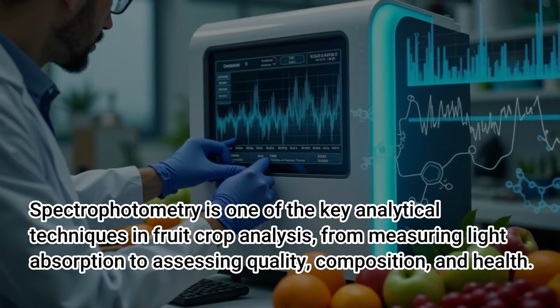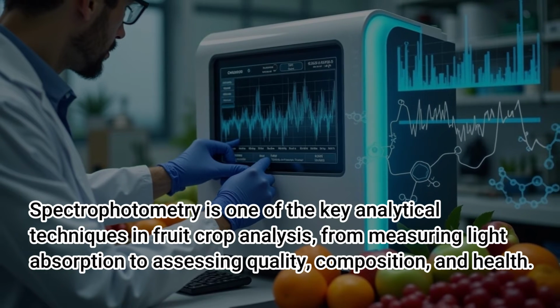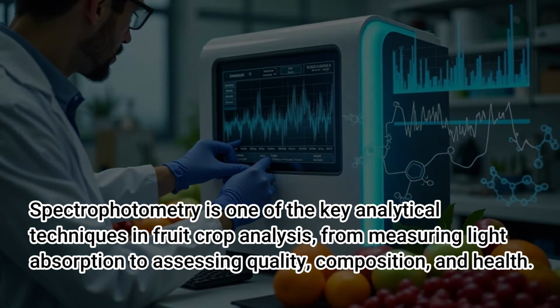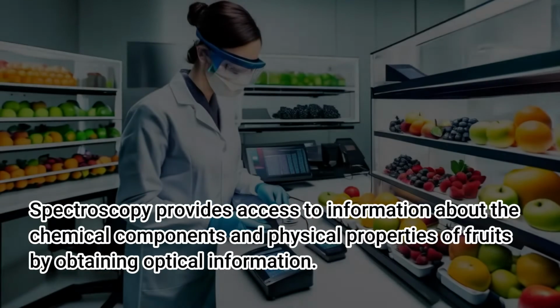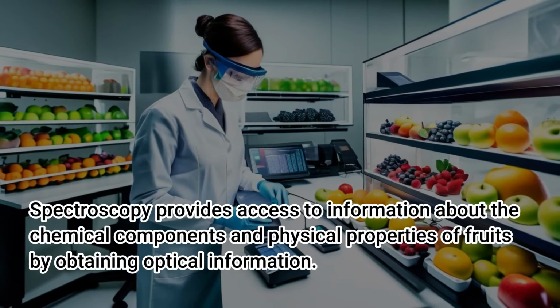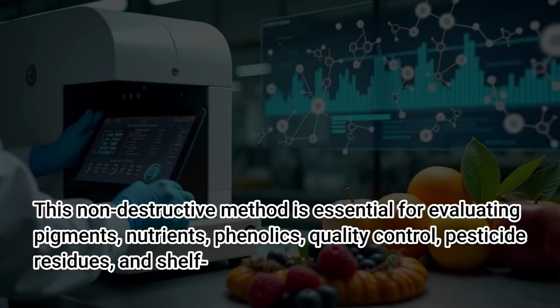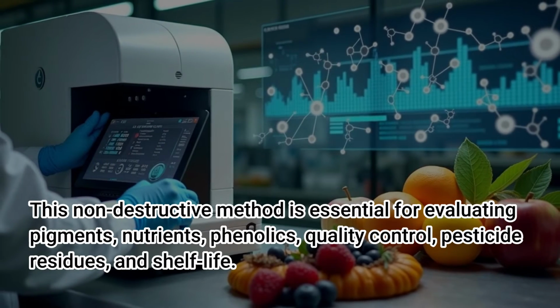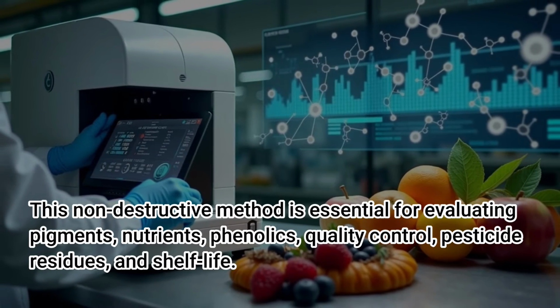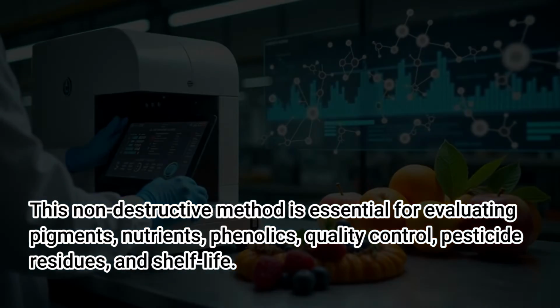Spectrophotometry is one of the key analytical techniques in fruit crop analysis, from measuring light absorption to assessing quality, composition, and health. Spectroscopy provides access to information about the chemical components and physical properties of fruits by obtaining optical information. This non-destructive method is essential for evaluating pigments, nutrients, phenolics, quality control, pesticide residues, and shelf life.